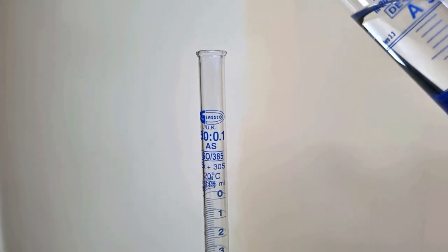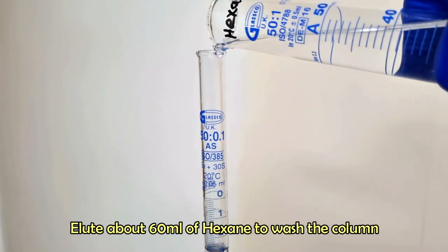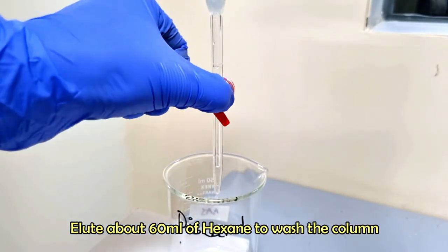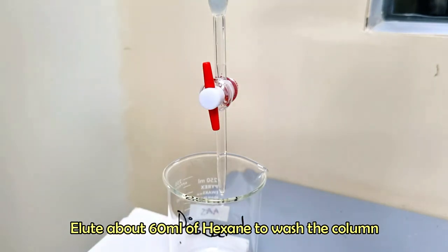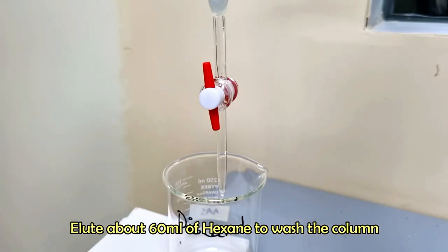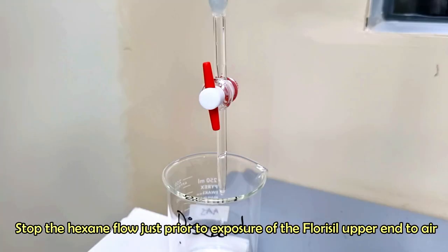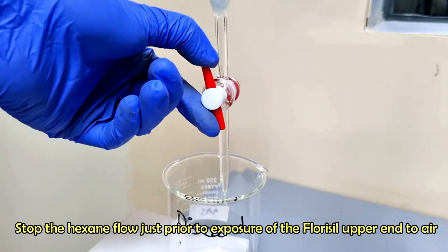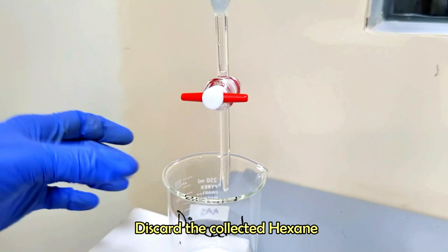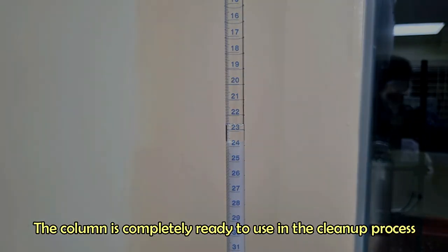Now elute about 60 ml of hexane through the column. Stop the hexane flow just prior to exposure of the florisil upper end to air. Discard the collected hexane. The column is completely ready to use in the cleanup process.